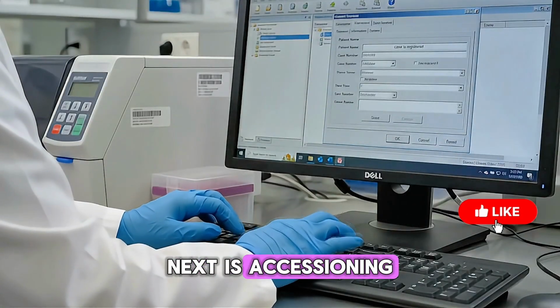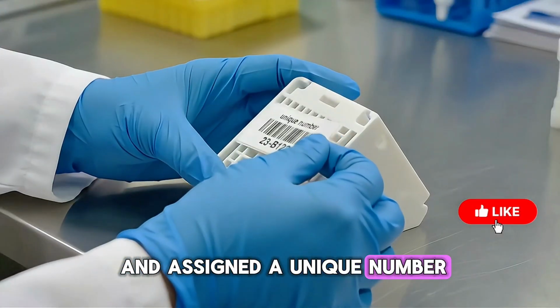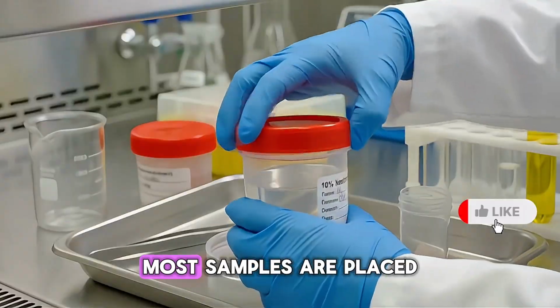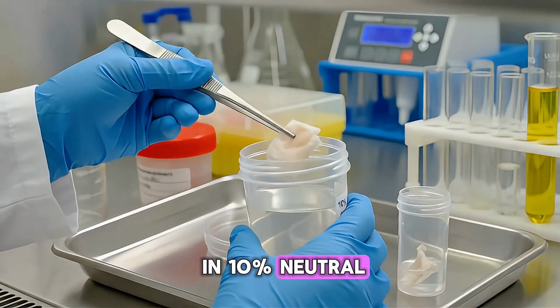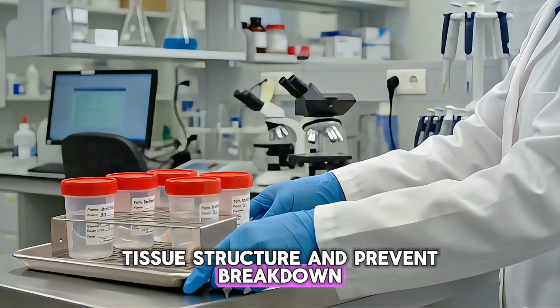Next is accessioning. The case is registered in the lab system and assigned a unique number used on all cassettes and slides. Then comes fixation. Most samples are placed in 10% neutral buffered formalin to preserve tissue structure and prevent breakdown.